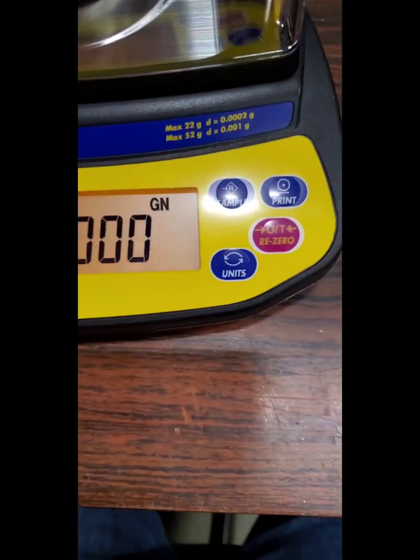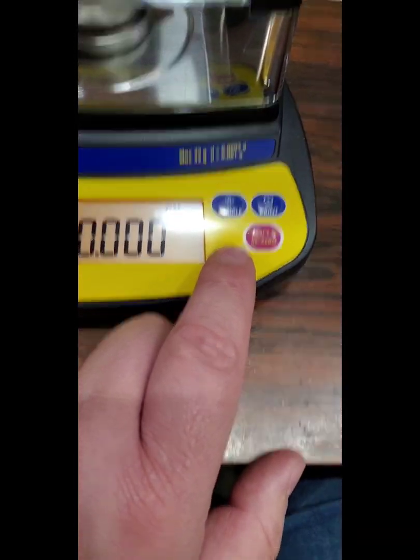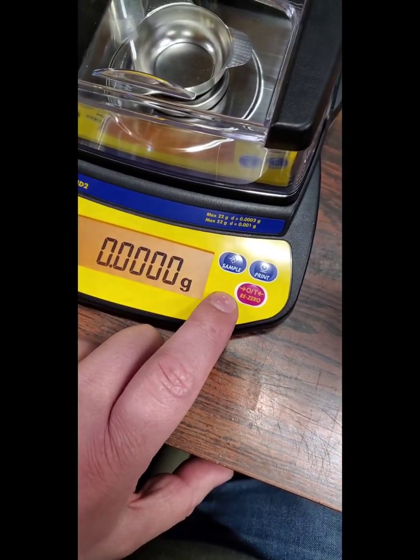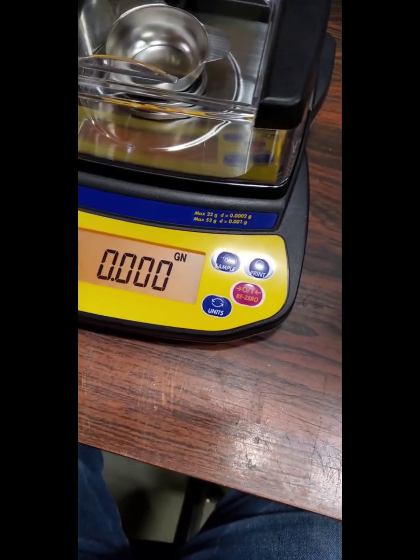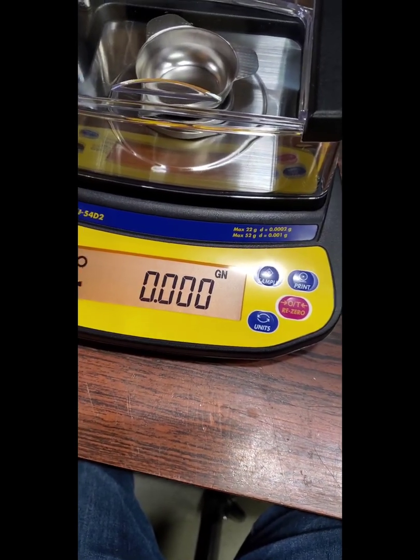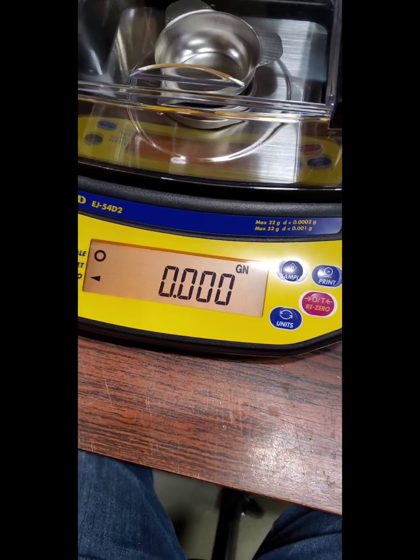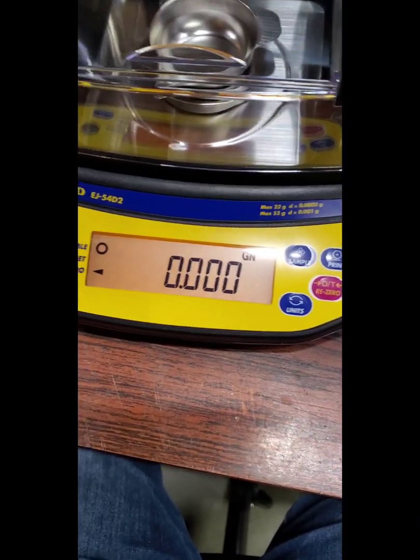There we go. So, hitting the units button over here. I'll get you out of the glare. I just have it programmed for grain and gram. It's really nice. You can go in and select which ones you want. There's about a dozen measurements that you can use, carats, yeah, a whole whack of different ones, moles, that you can use to weigh with, and I calibrated it.